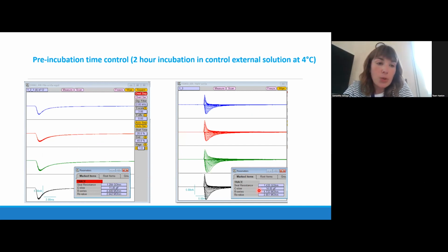After dissociating the cells, we stored them in the fridge for 2 hours and then undertook the fixed pulse protocol with all 30 sweeps superimposed here, followed by the IV curve. And you can see the fixed pulse is completely superimposable, so very stable, and the activation traces show good voltage control and are typical of NaV1.5 currents. And looking at the scale bar and capacitance values of the order of 10 to 12 picofarads, these currents are in the region of 500 to 600 picoamps per picofarad, which is completely consistent with the data I've already showed you.